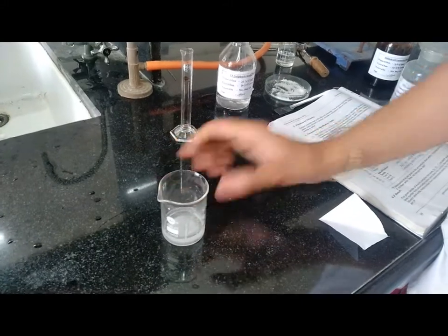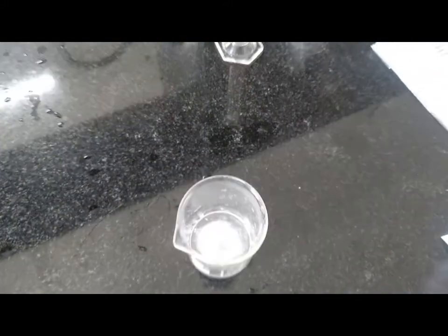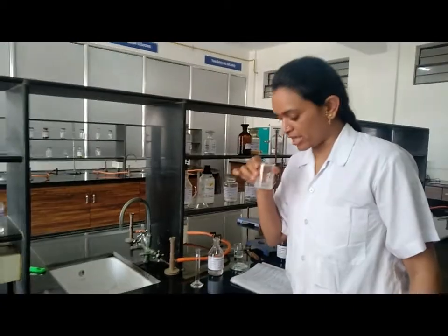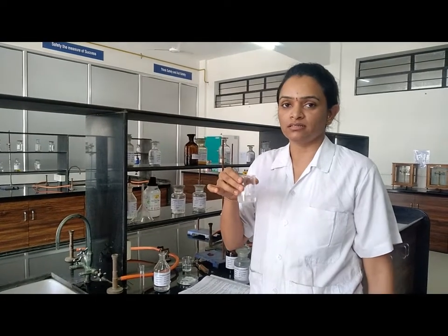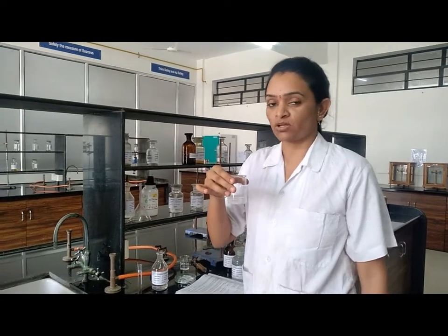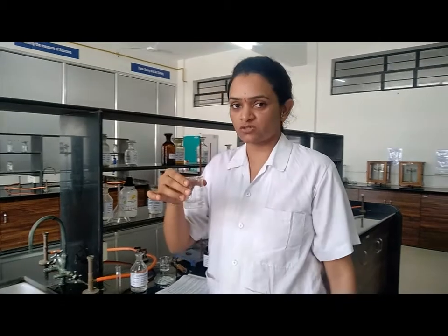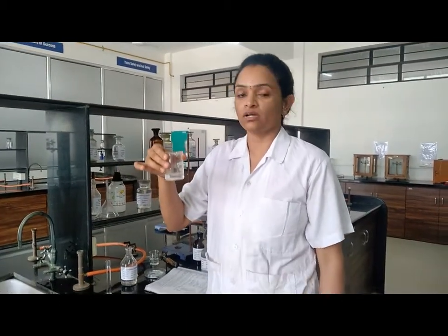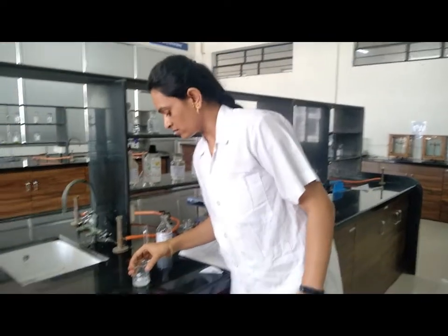Now we get this white crystalline powder. A white crystalline precipitate is produced in this solution. We have to filter this solution, and this solution has the odor of acetic acid. We have to filter this solution and separate the crystalline powder so that the further procedure can be carried out.